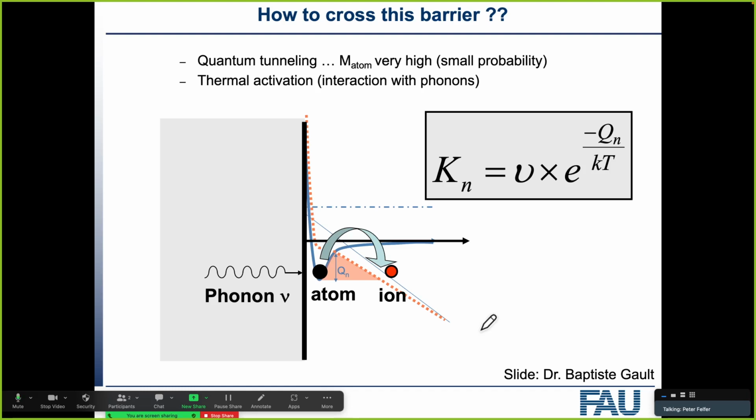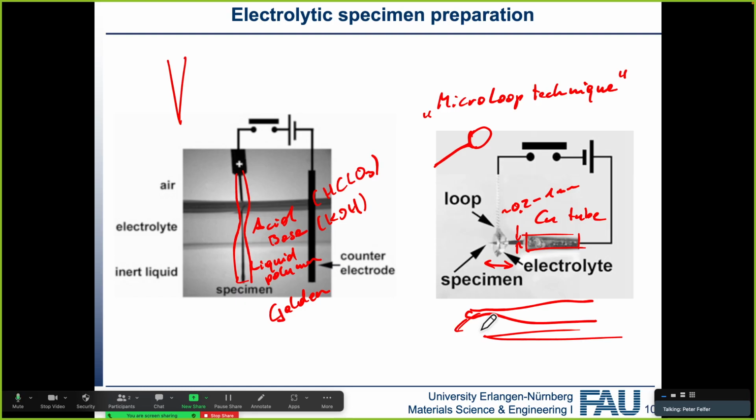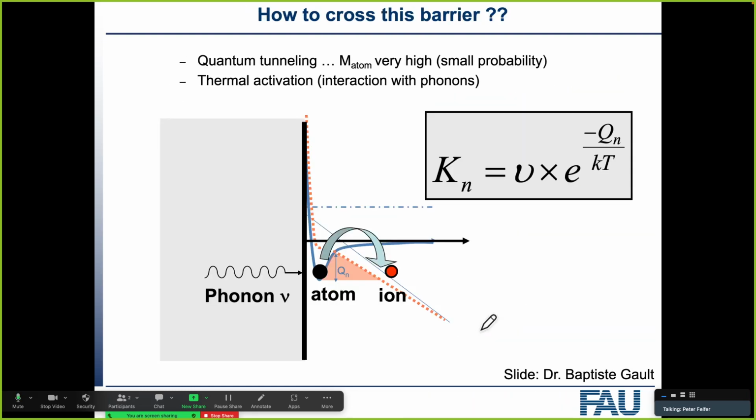How does the whole field evaporation process work? Yeah, because in principle, we're working on specimens that don't want to emit individual ions or individual atoms, just simply because otherwise there would be a gas. But we're working on solids. Solids don't want to, well, atoms don't want to naturally come out of solids, otherwise it wouldn't be a solid, because it would just be sublimating.